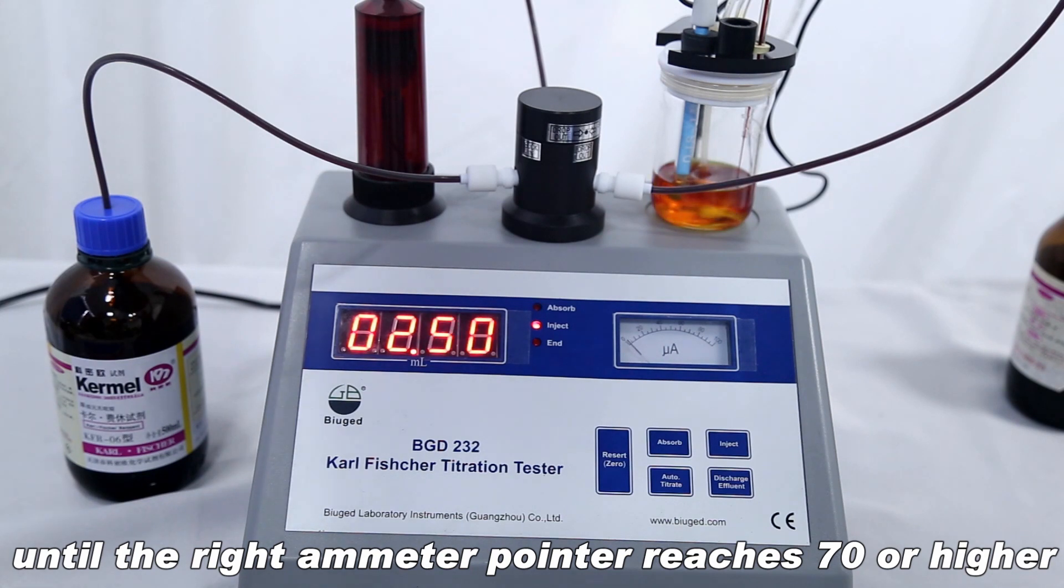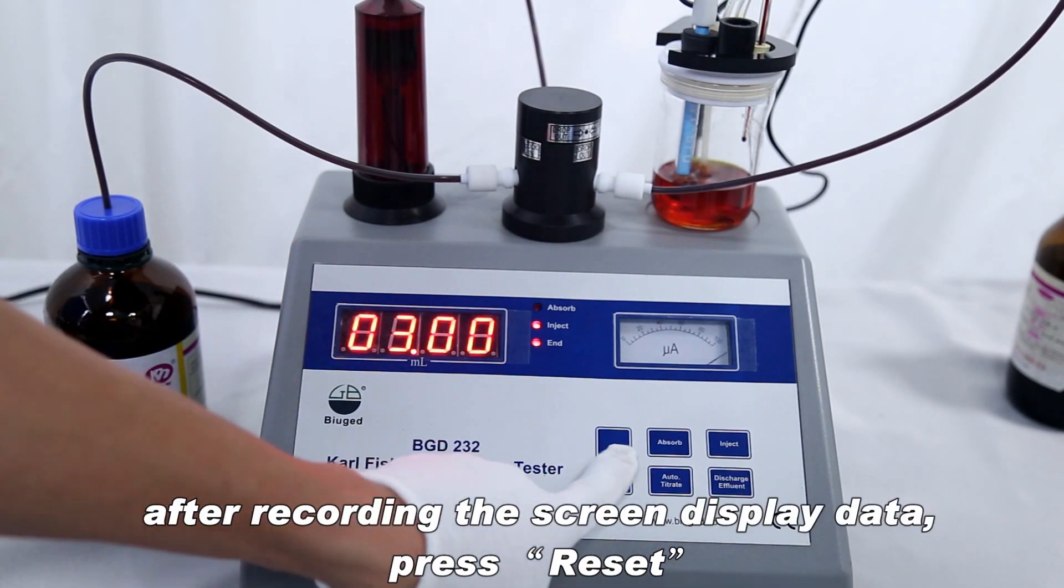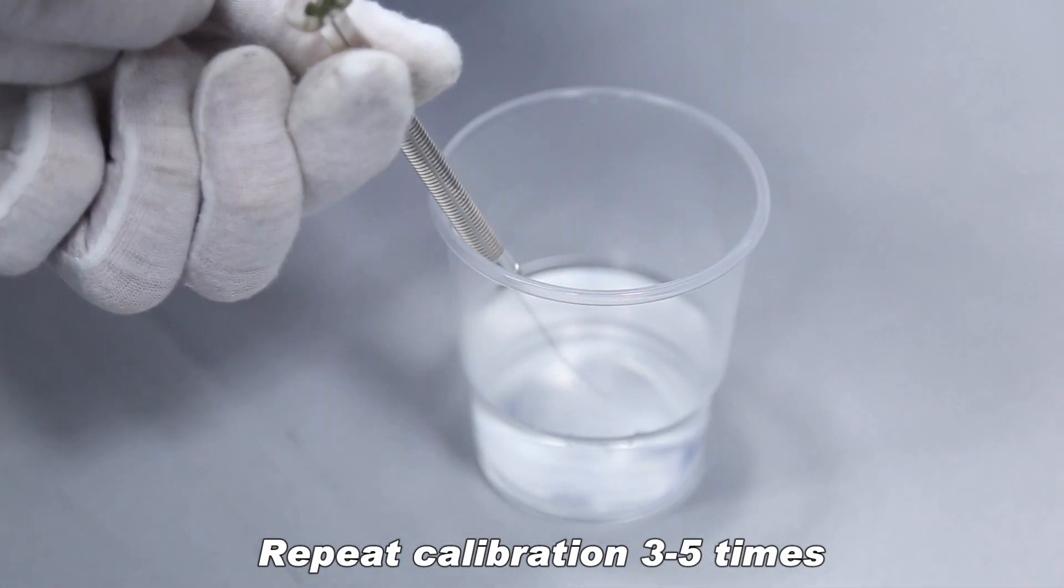Until the right ammeter pointer reaches 70 or higher, the instrument stops titrating and beeps. After recording the screen display data, press reset. Repeat calibration 3-5 times.